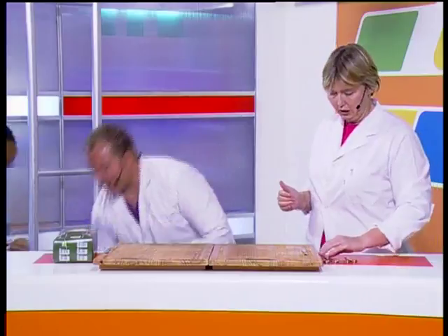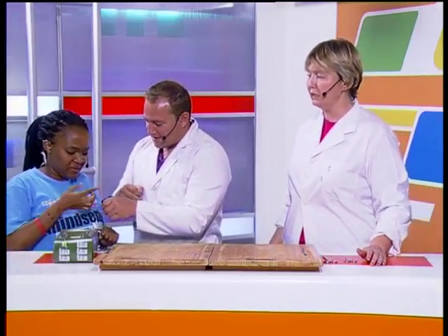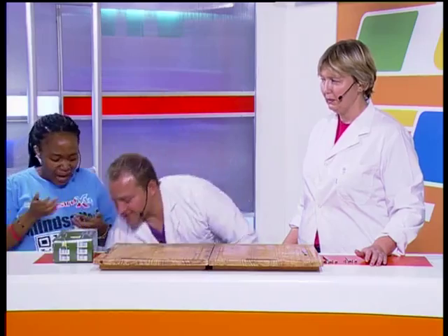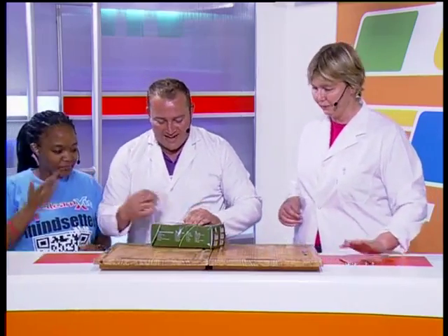Oh yes, we need the good smelling stuff. It gets a bit hot under your nose. Come, Looney. Don't be stingy. Little bit. That's it. Do I put it just under? Just under your lip. Like that, that's it. It's just so that you smell that or not, it's still going to stink, I promise you. But this is going to smell better. We need this stuff.